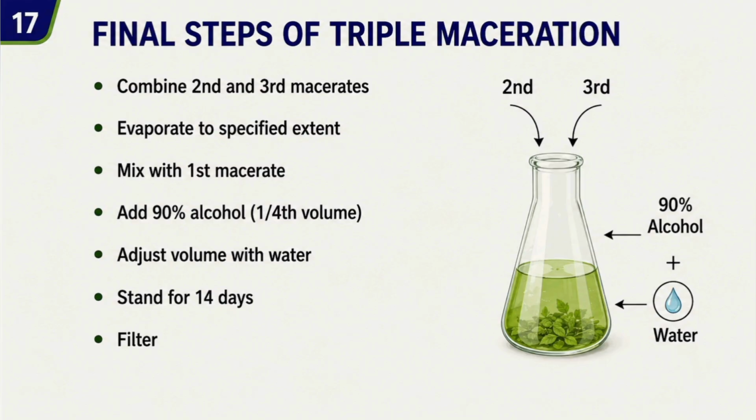Notice how carefully the procedure is controlled. Extraction is not simply putting a plant into a bottle. It involves solvent ratio, contact time, concentration, evaporation, and volume adjustments.